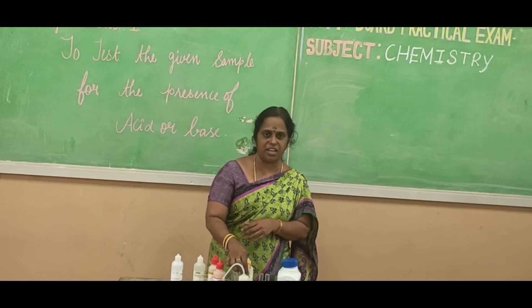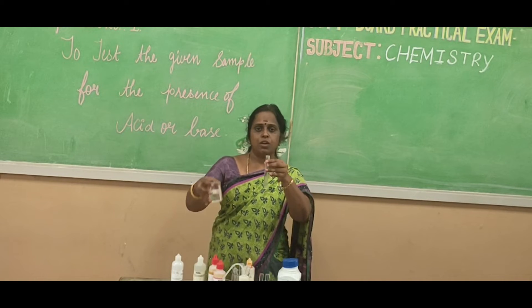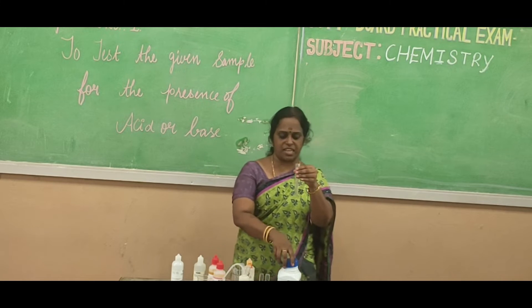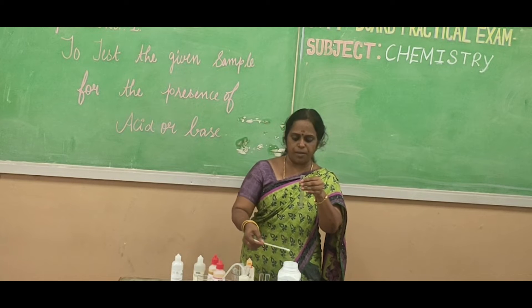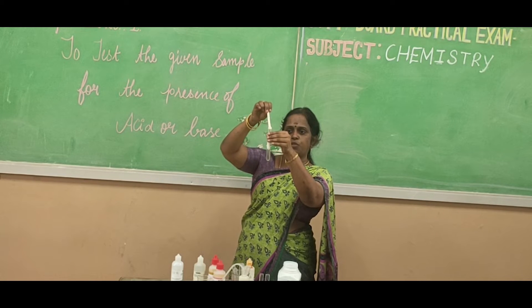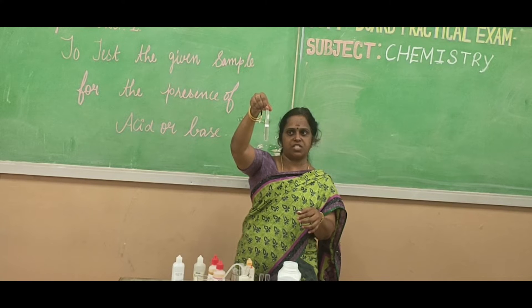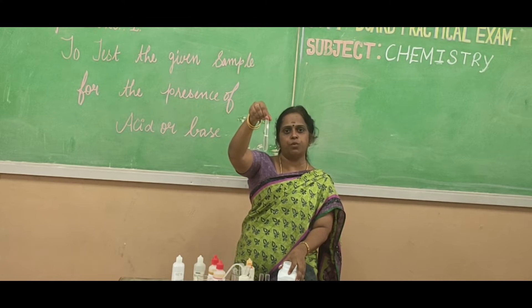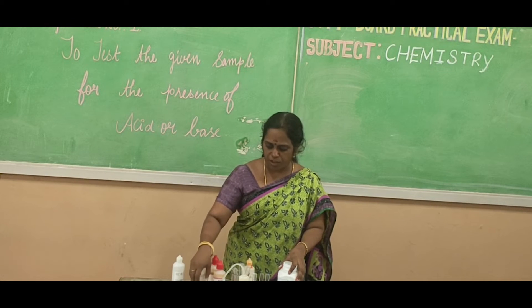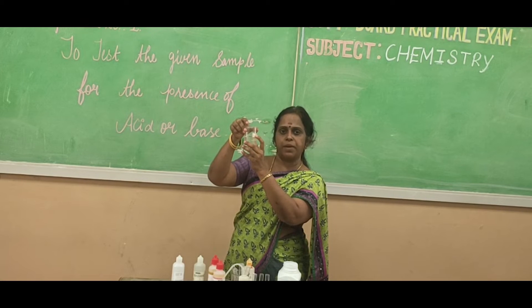Similarly, we proceed to the third indicator — sodium carbonate. Take a test tube, add 5 ml of the test solution, and add a pinch of sodium carbonate to this test solution. What do you observe? You observe brisk effervescence coming out of the test tube, and this also confirms the presence of acid. So the given solution labeled as B is an acid.